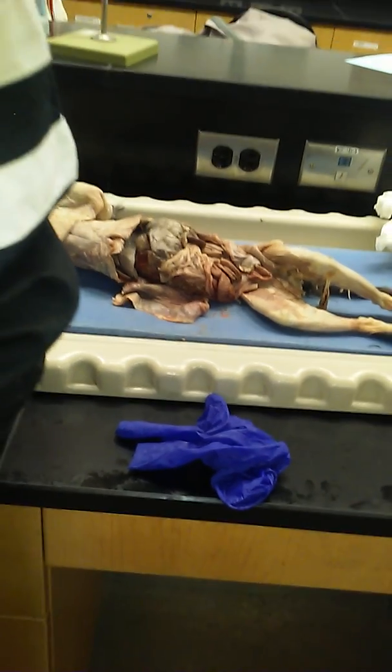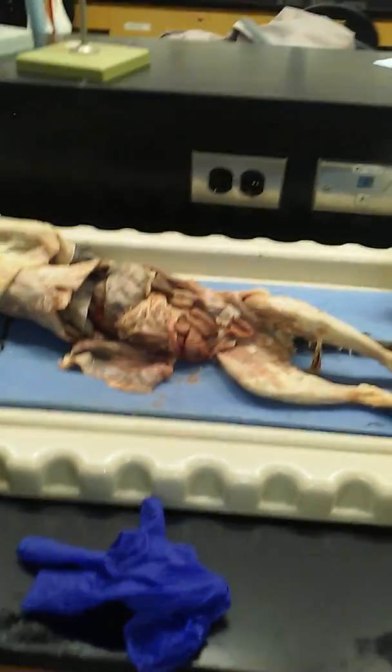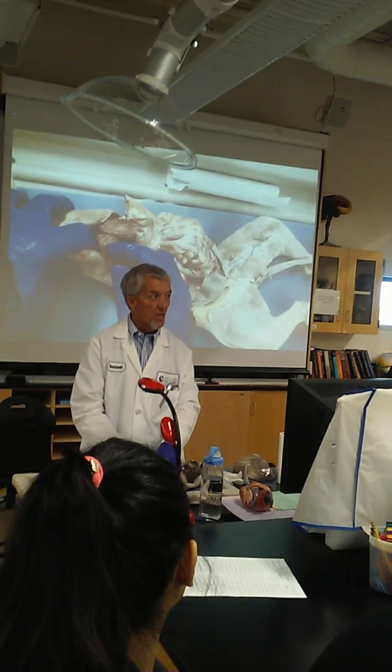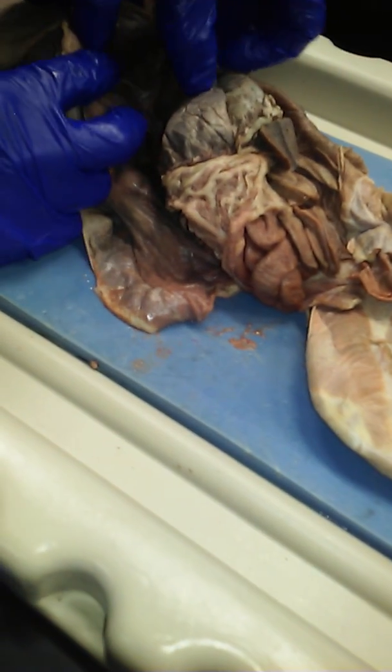Two lobes, lateral and medial. Look right between them. Just spread them gently apart. And right between them, you'll see a little balloon. A little tiny balloon right there. That little balloon is the cat's gallbladder.